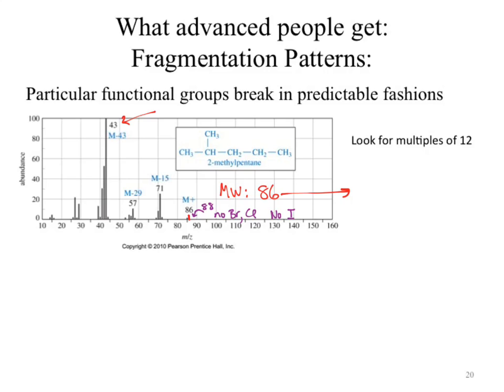So we can go through, take our mass of 86, divide by 12, and get, I'm horrible with my multiples, 72, so what is it, 6 and change? 6 point some numbers, which means we likely have 6 carbons, which gets us to a total mass of 72, right?